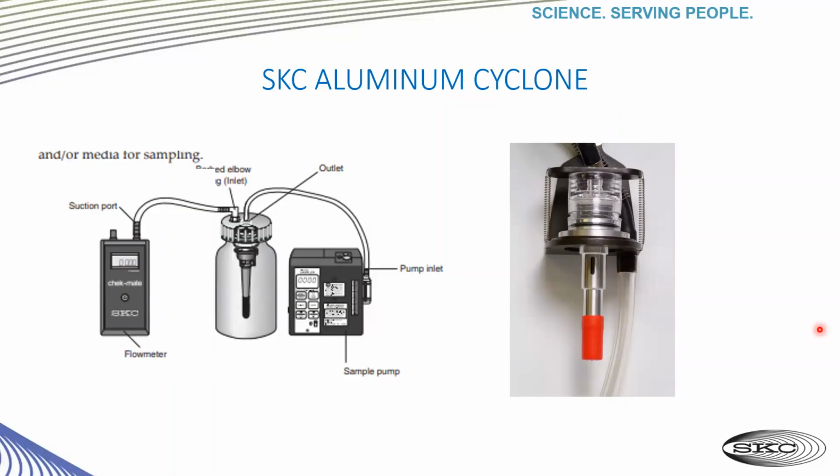So hopefully I will not slip up and use the term calibration improperly. It's hard to do after 30 years of habits, and old habits die hard, but it is still part of the name of some of the parts in this presentation, like the calibration adapter, but eventually that will need to change as well. So I just wanted to give some verification of what that means. In the past, we would have called it calibration.